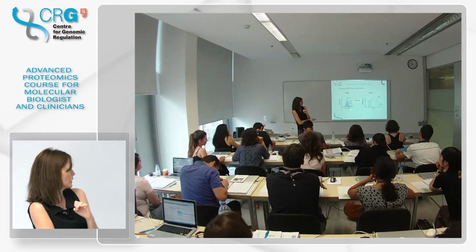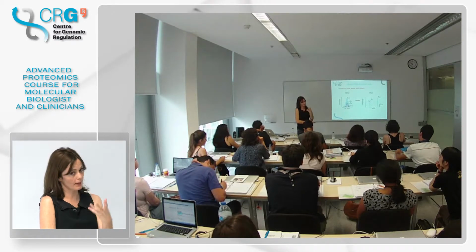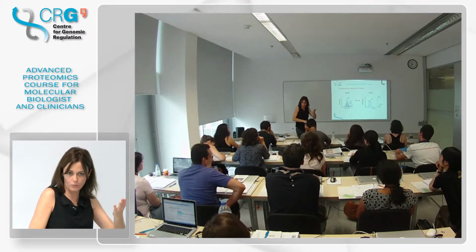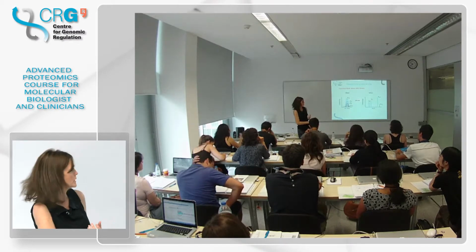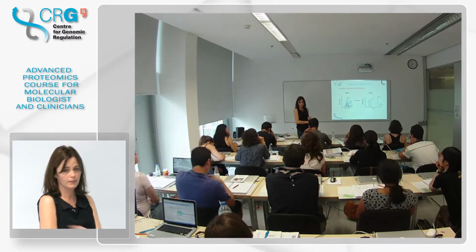The heavy and the light will have the same pattern here and the same pattern here, because this has to correspond. It can vary if this has been acquired in one instrument and this in another, which happens very commonly, but still it is more or less the same. It cannot be that here I see the Y6, 7, 10, and 11, and here I see the 8, the 9, and the 5. It's not the same peptide.